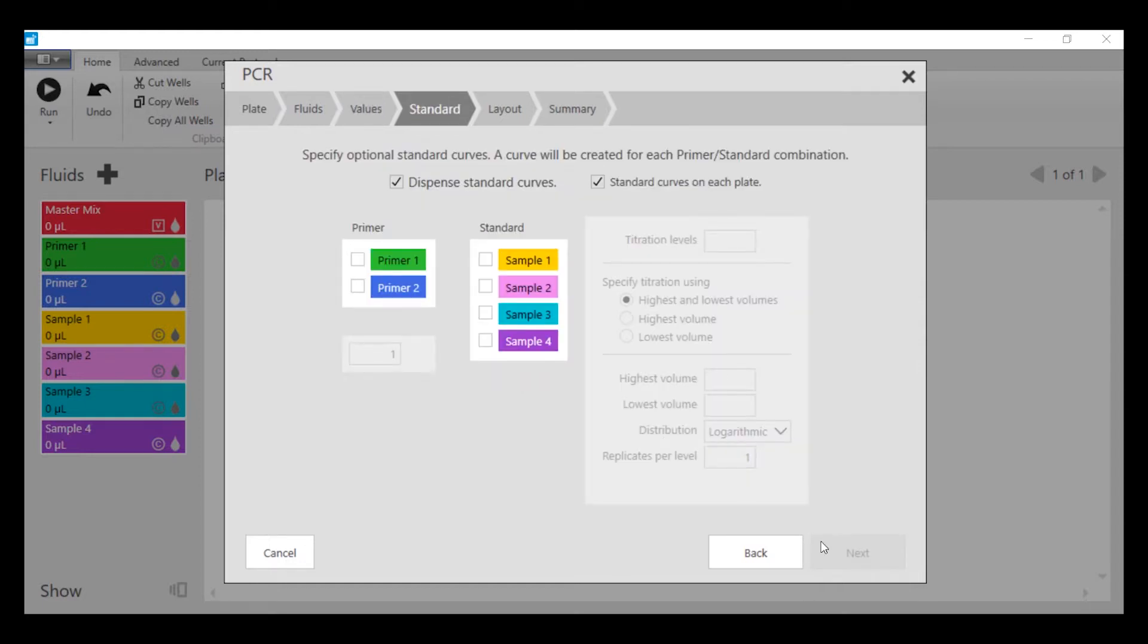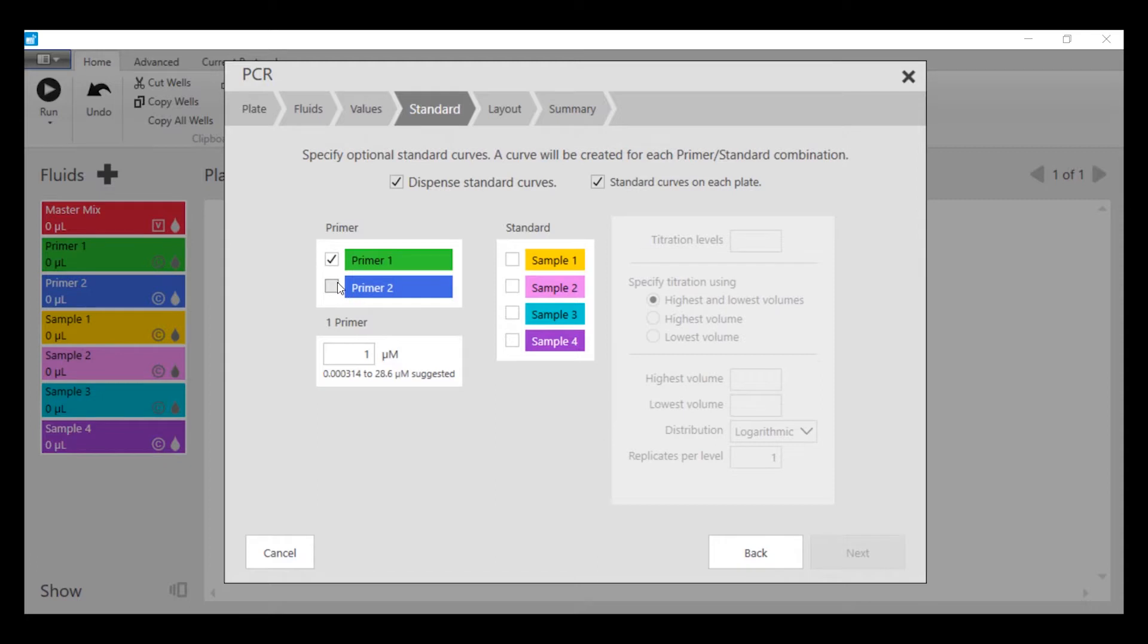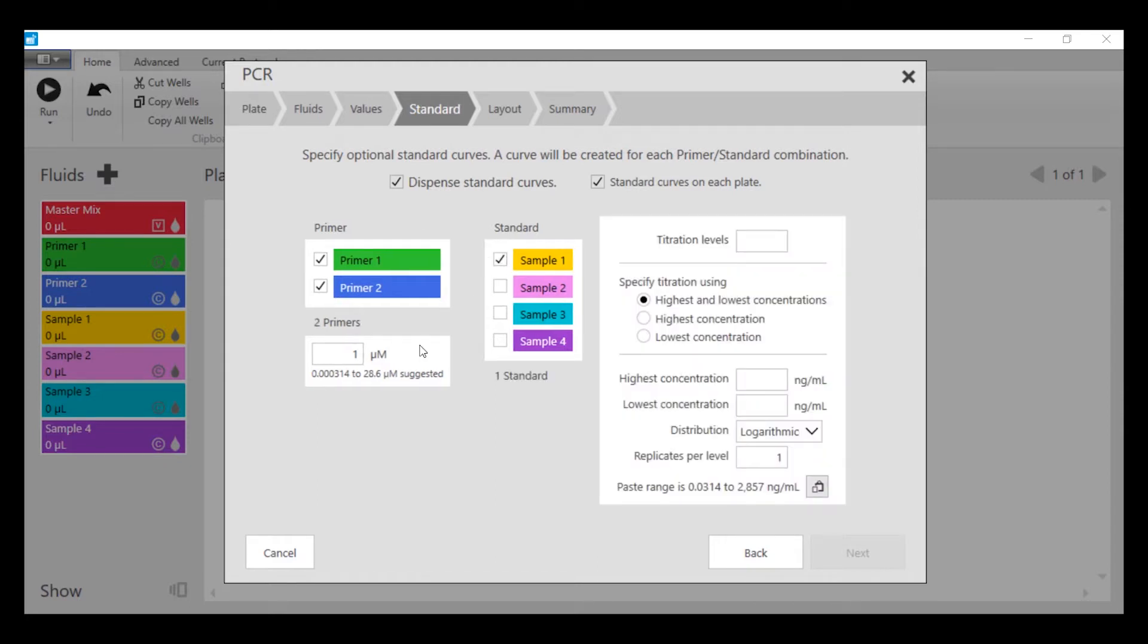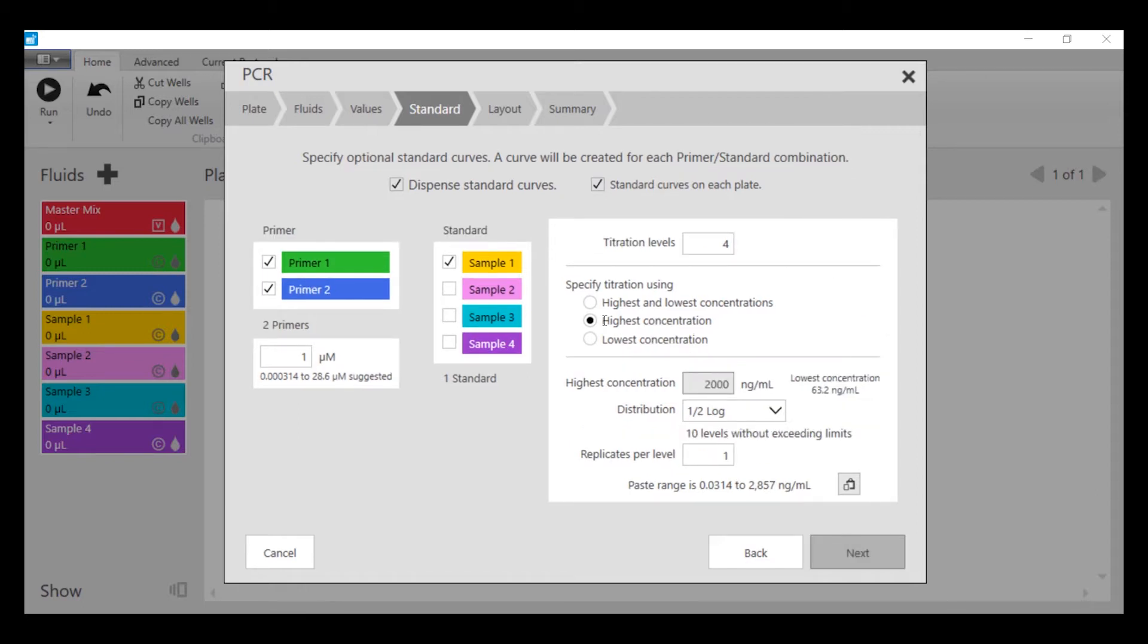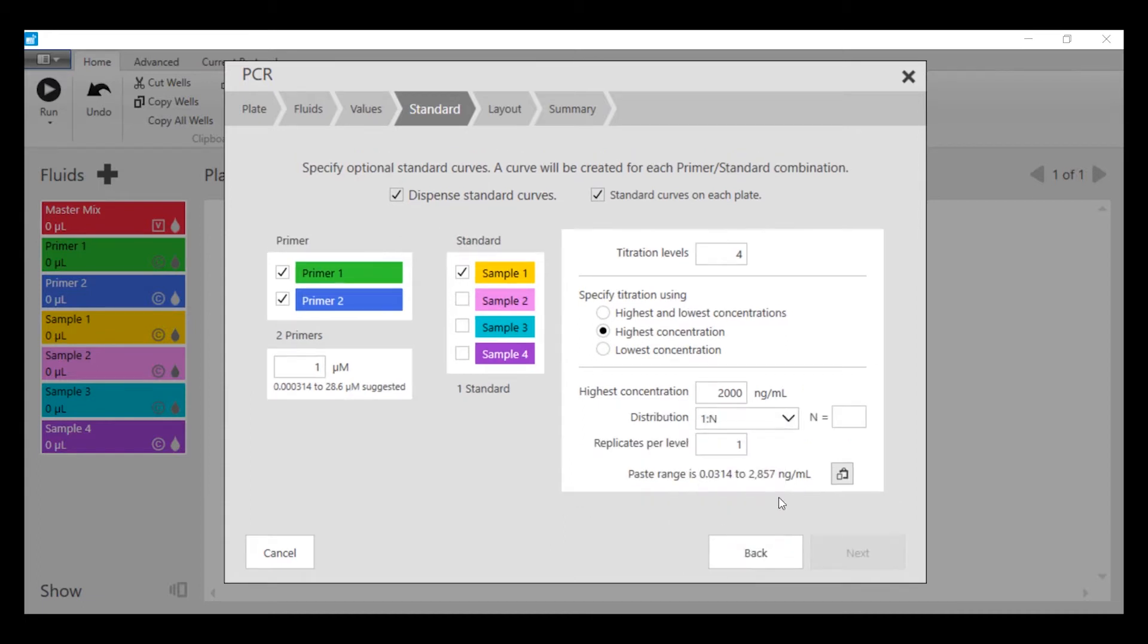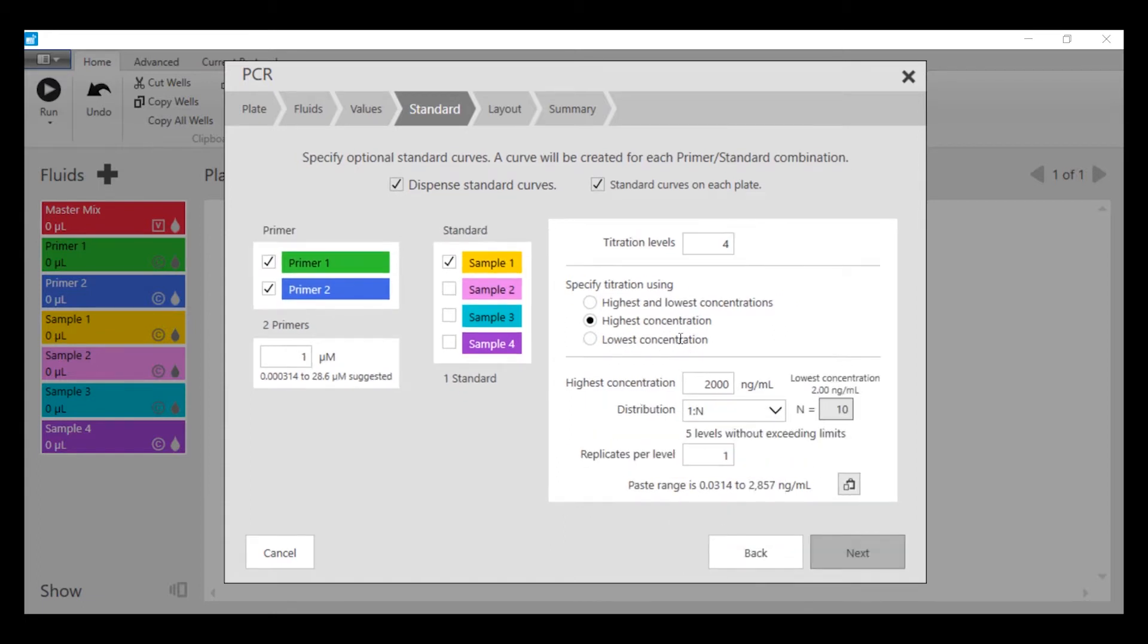Next, we're going to set up a standard curve for this plate. We're going to use both of our primers against a single sample. We're going to keep the primer at 1 micromolar. We're going to do our standard curve with four levels using 2,000 nanograms per mil or 2 micrograms per mil in a 10-fold dilution, where we set a 1 to n with n equals 10. And again, we're going to do the standard curve in triplicate.